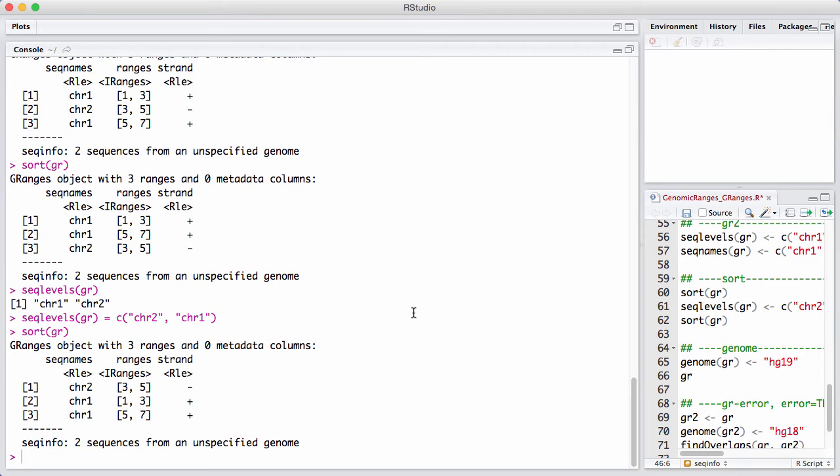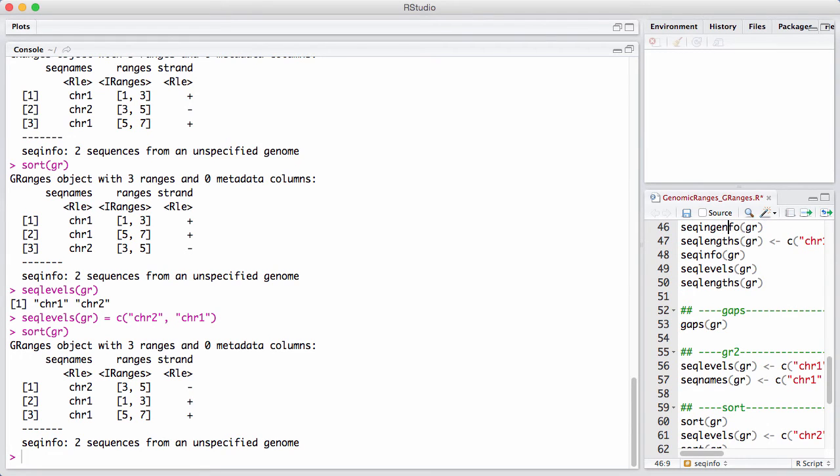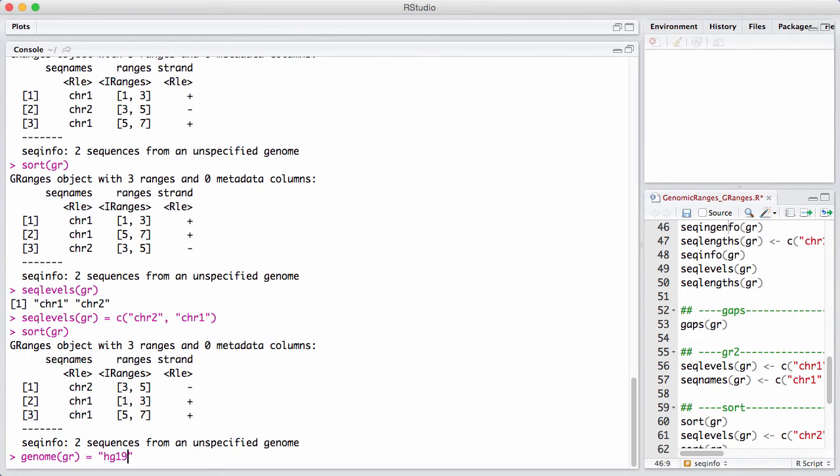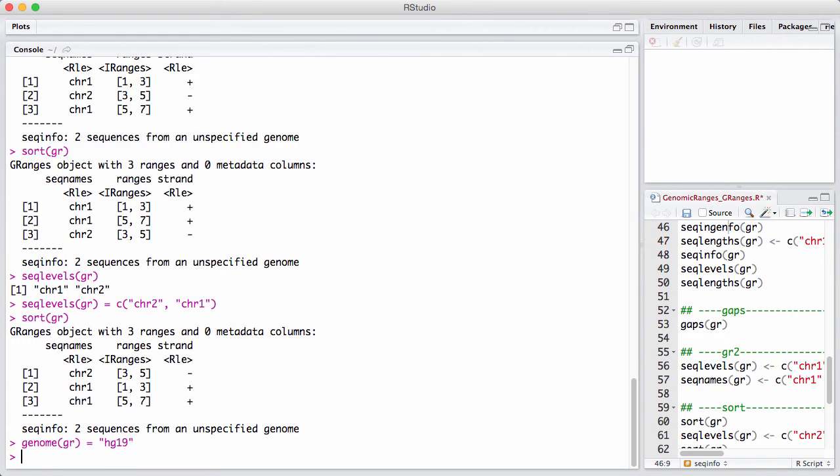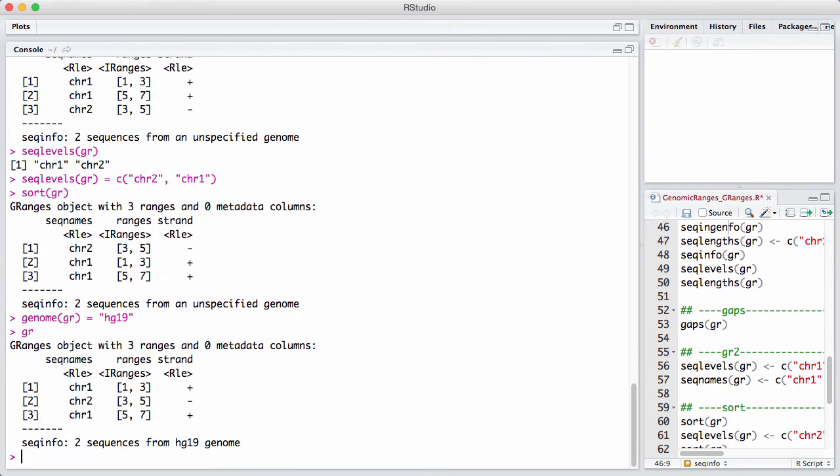We can also assign a genome to these different things. So let's try to do that. Let's say that the genome of this GRange is some string, let's say HG19. And we print it. We can see it all comes from HG19.